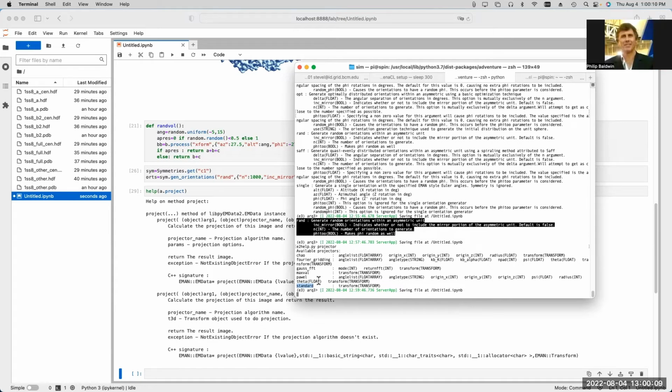So even if you use the same interpolation kernel, you're only sampling that kernel at like the 8 neighboring points around it. And that means that it can produce some funny sorts of artifacts if you look at the projections in real space. So you can make projections in Fourier space, but they often turn out with more artifacts than you'd like. So even though it's a little bit slower, we usually make our projections in real space.